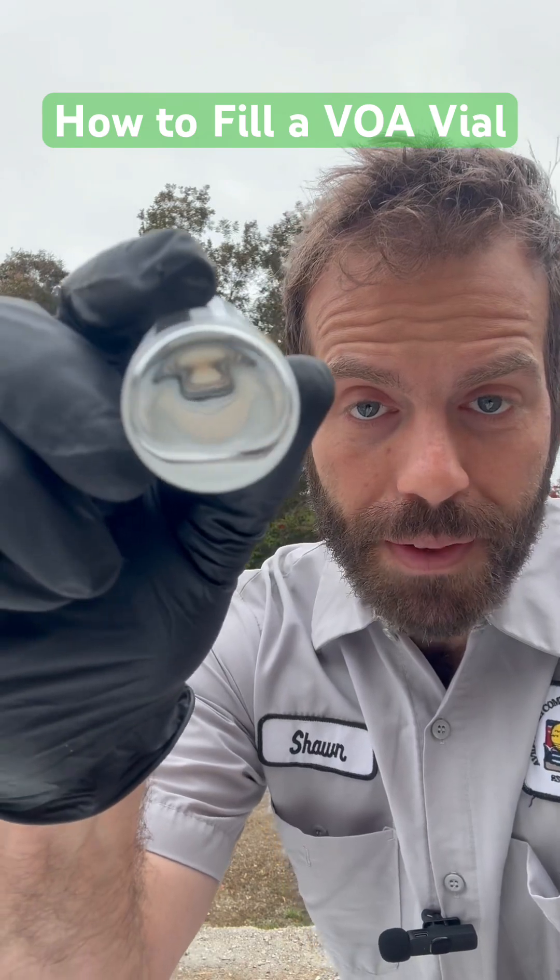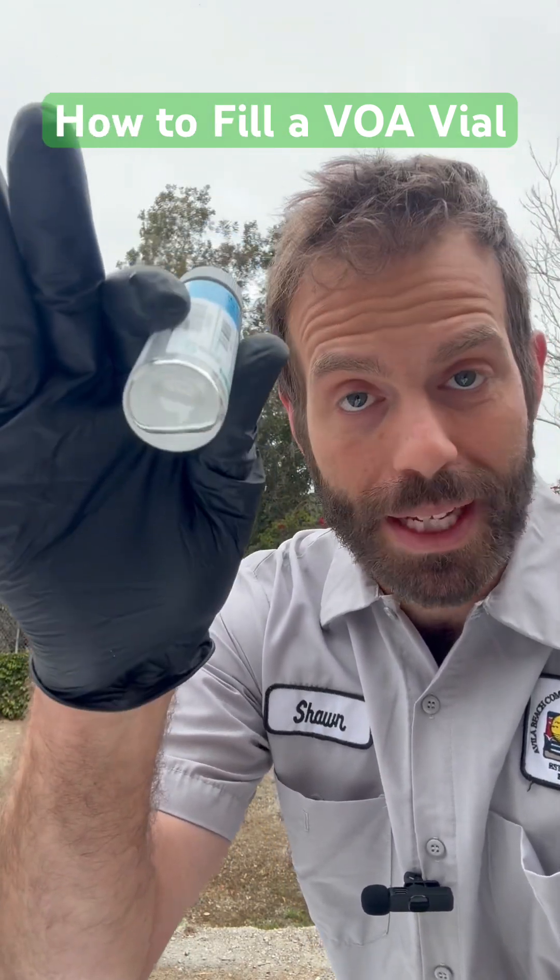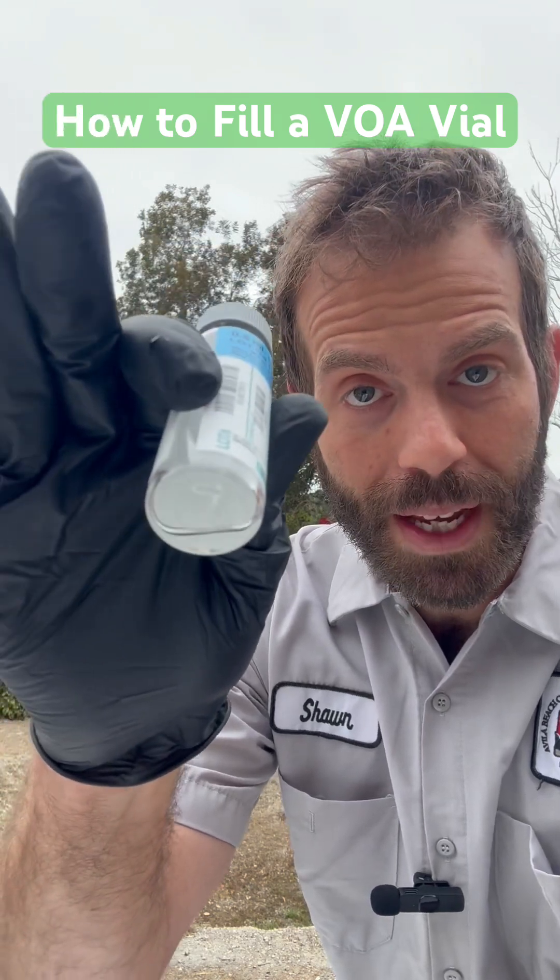Game number two is you'll see there's a preservative in here. This one's hydrochloric acid. We're going to make sure that it doesn't displace. So we're going to carefully pour it in here.